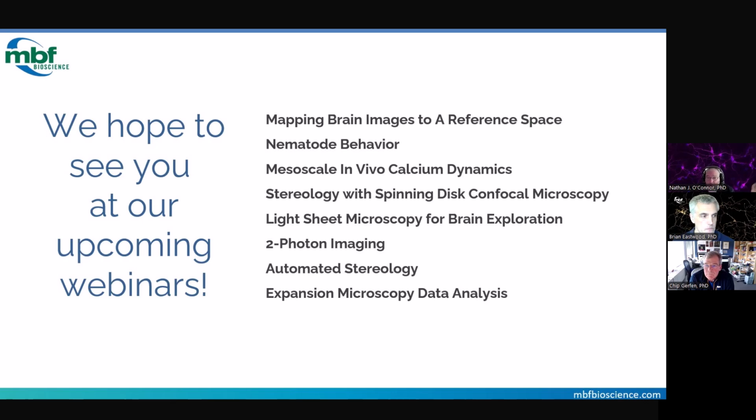Someone asked, do we have a workflow for mouse spinal cords? And again, you could reconstruct spinal cords. We have folks doing that, but getting to the registration to an atlas and the annotations and data mapping and such, we don't actually have an atlas for that. If you ever know of a digital atlas, there are some aspects to an atlas that are necessary to be able to integrate into a 3D registration system, but we're always happy to take a look at an existing atlas.